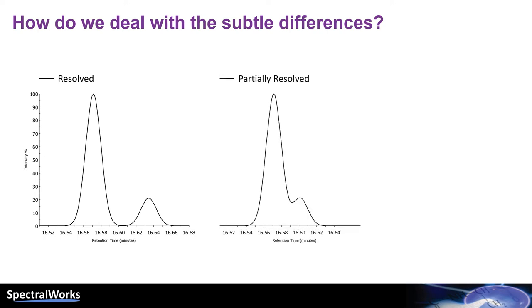What happens as the components become partially resolved? Well, depending on your peak detection algorithm, you may or may not get two components. Finally, what happens when we have unresolved data and the components are overlapping or we have partial coelution?